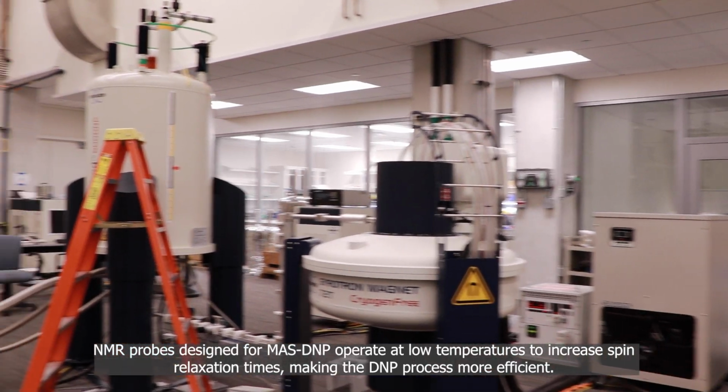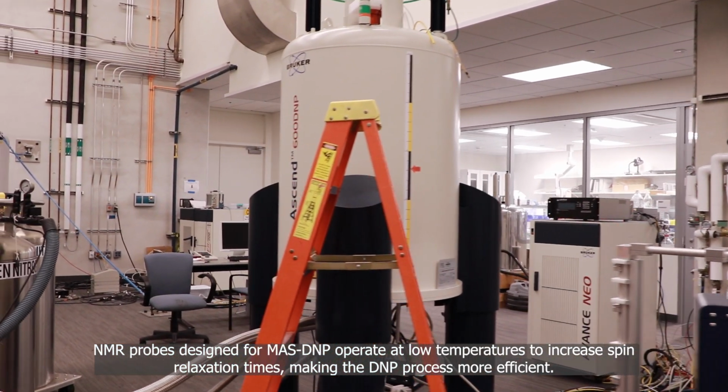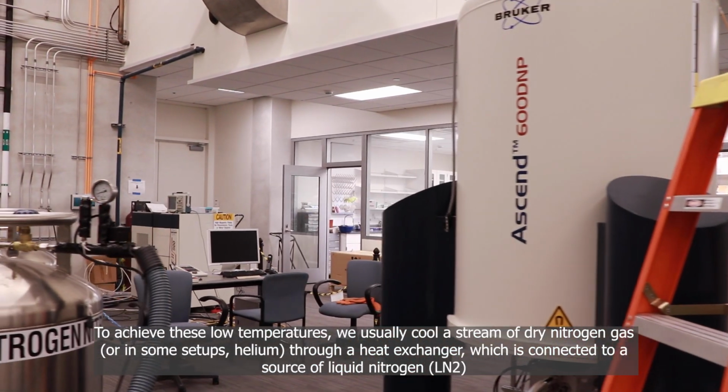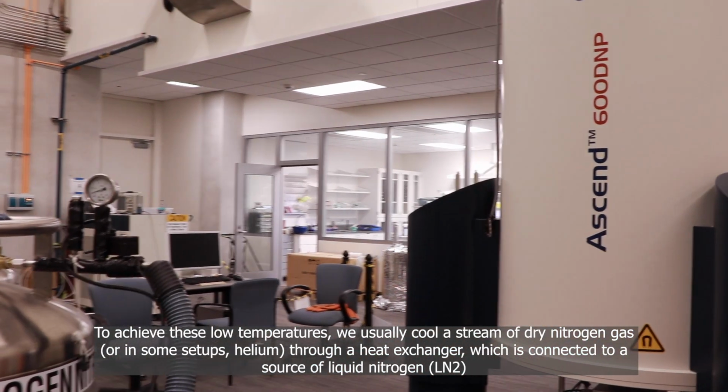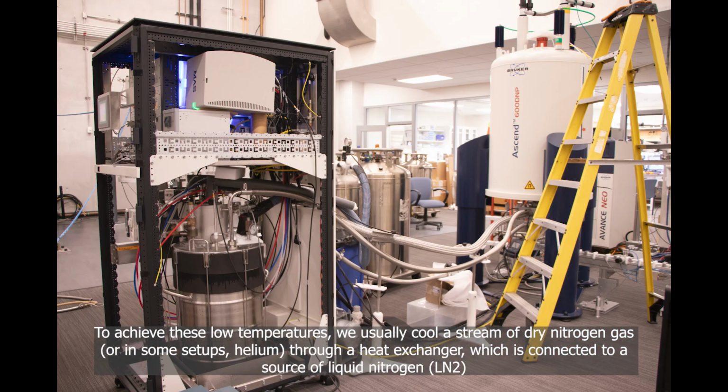NMR probes designed for MAS DNP operate at low temperatures to increase spin relaxation times, making the DNP process more efficient. In order to achieve these low temperatures, we usually cool a stream of dry nitrogen gas, or in some setups, helium, through a heat exchanger.